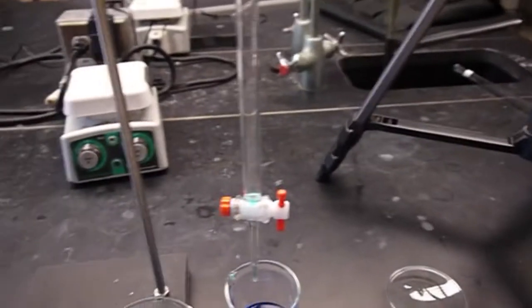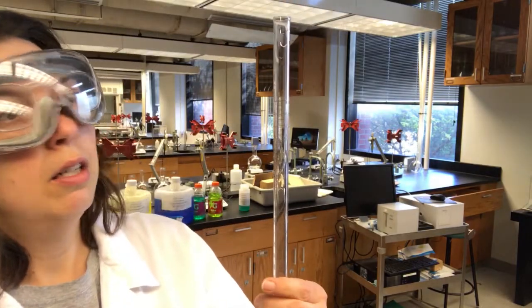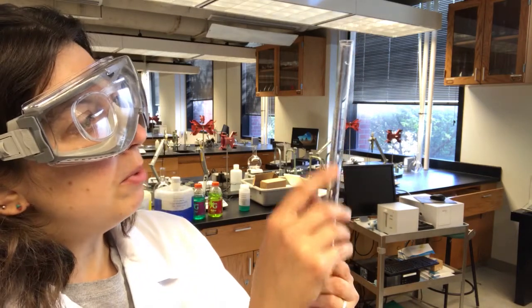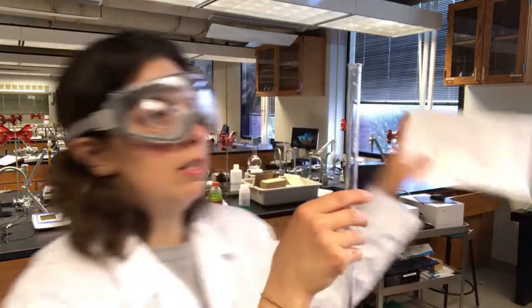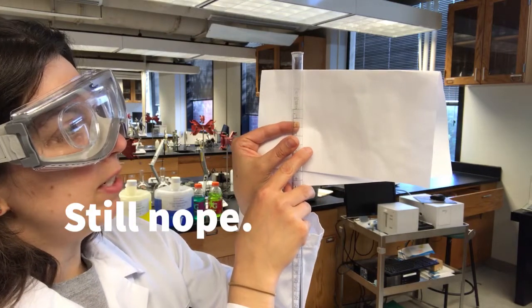So in your lab drawer, you're going to have two 50 milliliter Burets. Let's see if I can focus in here at the top. This might be a little challenging. The numbers are so faint. So at the top of the Buret, I know this is pretty faint on this one, but you should be able to see the letters TD and 20 degrees Celsius.